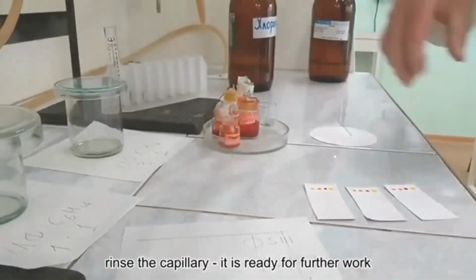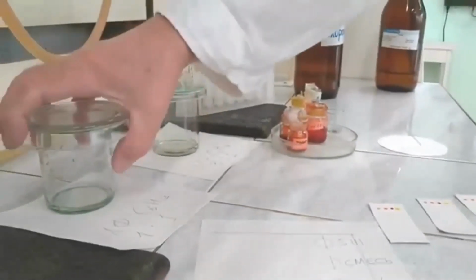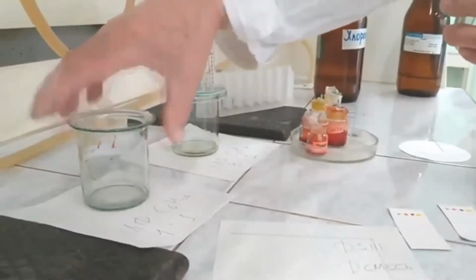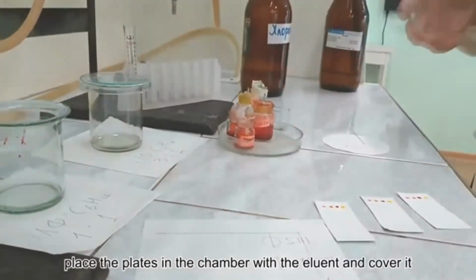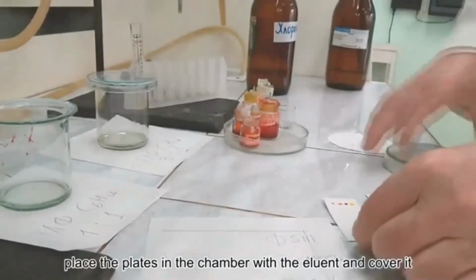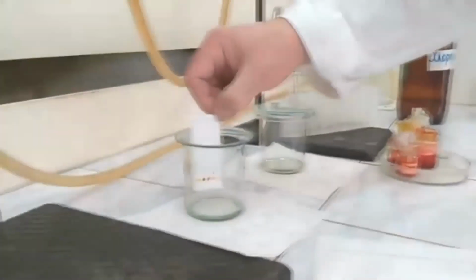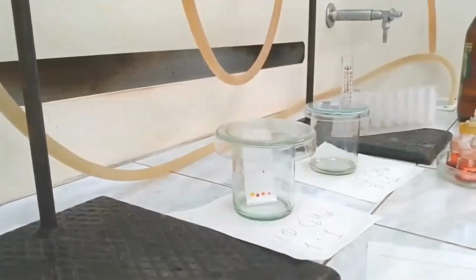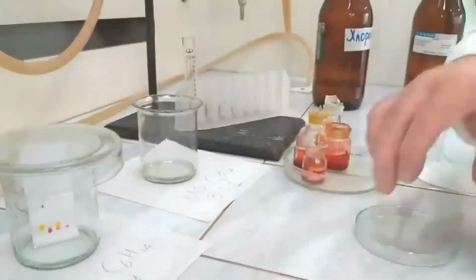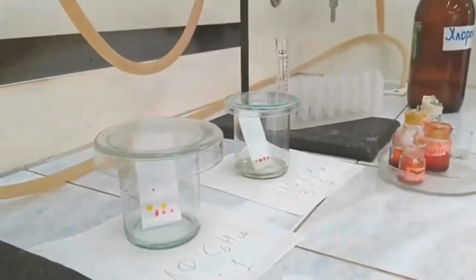Значит, после того, как пятна подсохнут, они наносились из хлороформового раствора и уже должны высохнуть. Пластиночка аккуратно умещается. Аккуратненько помещается в камеру для хроматографии. Довольно уверенно. Вот так ставим и все. И накрываем. Раз пластинка и два пластинка. Вторую камеру. Опс. Все. И теперь нужно дождаться, когда фронт дойдет до верхней черты.